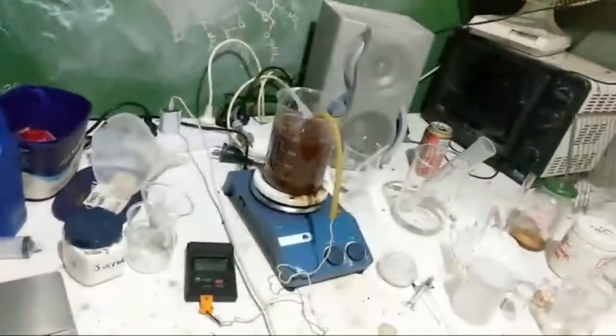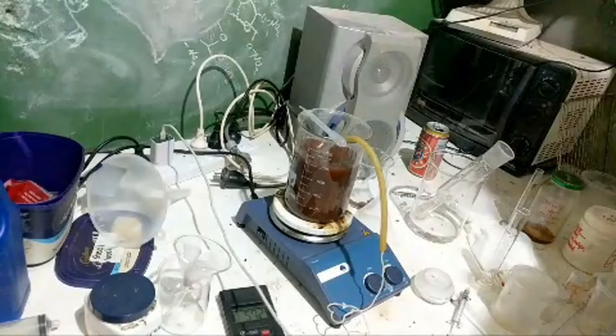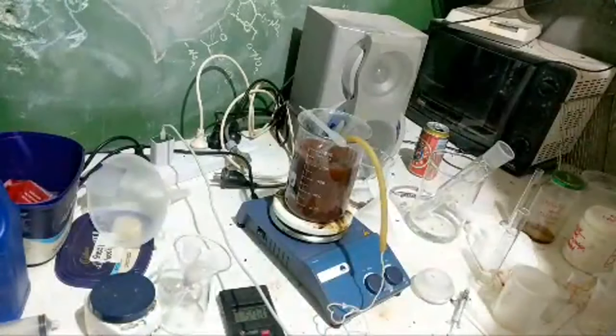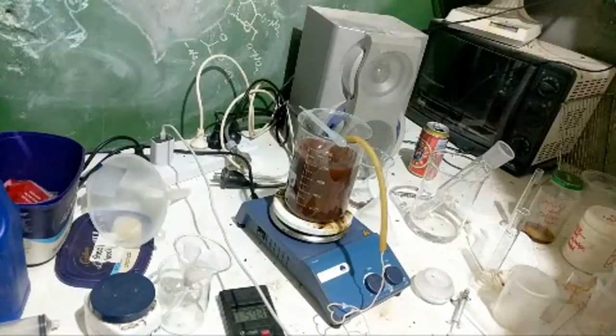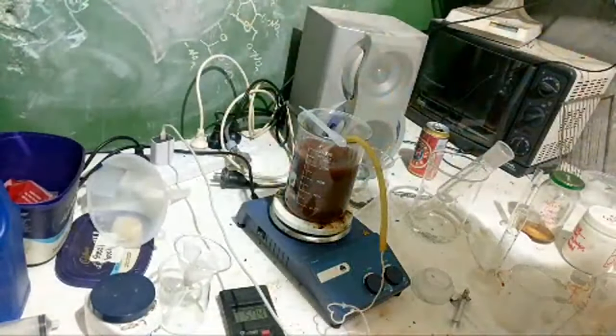Let's go back inside. Let's see what chat thought about that. Hopefully, it didn't drop out. Okay, no, this is a really bad idea, but I'm already here, so here we go. No rubber gloves over flames. Good point. Forgot about the gloves. Thank you.